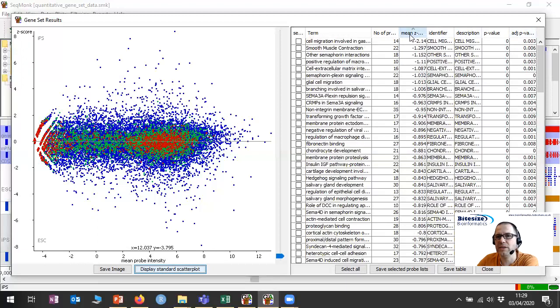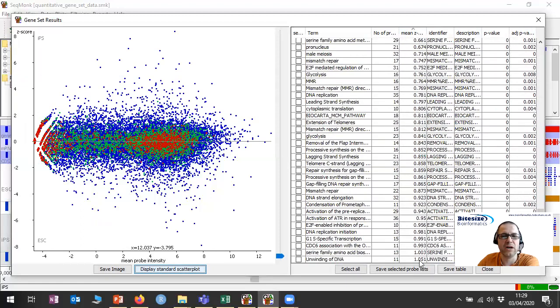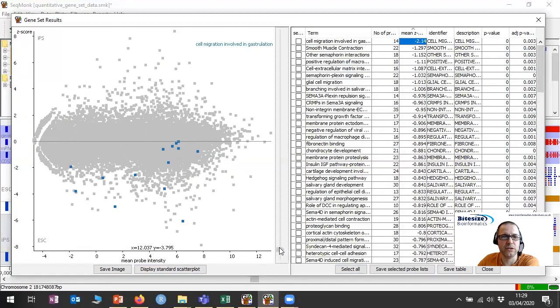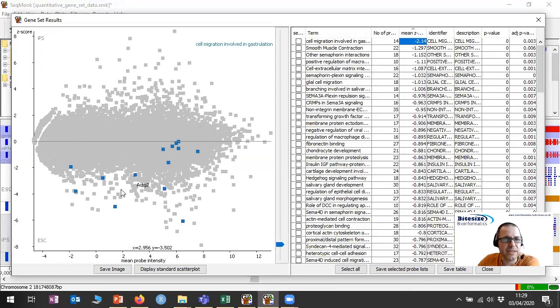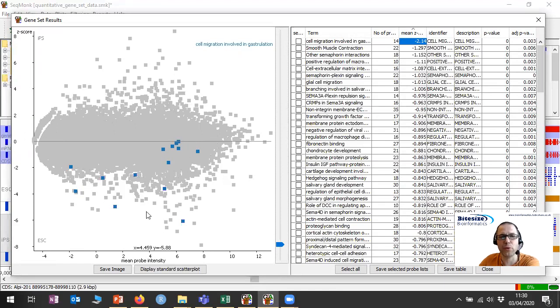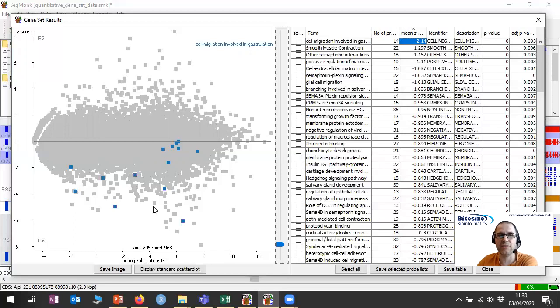We can sort these lists on either the mean Z-score or the p-value. Let's start by sorting by the Z-score to see the most interesting ones — things that are most interesting will either be at the top or the bottom of this list. Here we've got the most negative Z-scores. If I click on one of these, it will highlight that list in the scatter plot. I can use the slider to make the points a bit bigger. You can see all of these blue points are in this cell migration list, and they're unusually skewed towards being negative — there are one point just about on the line, but every other point is negative by different amounts. That's fine with the Kolmogorov-Smirnov test — it just means they need to not sit on the line.